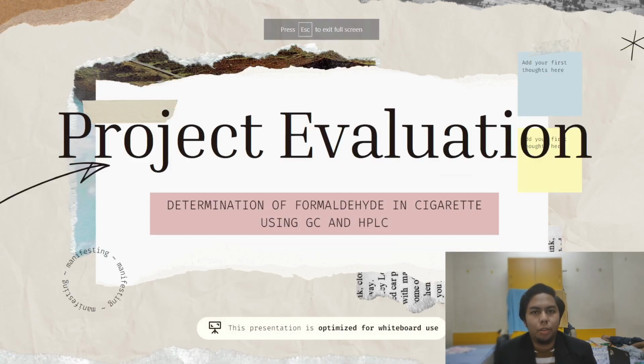Assalamualaikum and a very good day, Dr. Nurhayati binti Abdullah. Me and my other group members will be presenting to you about project evaluation for determination of formaldehyde in cigarette using gas chromatography and HPLC.